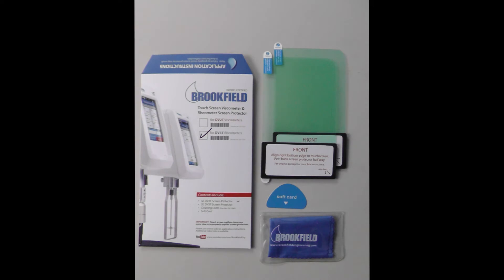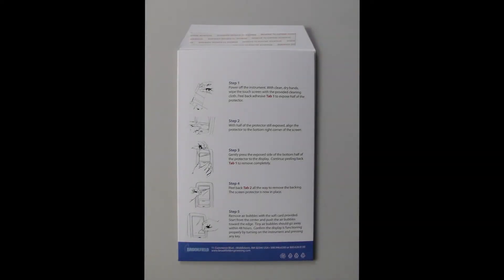Brookfield Engineering offers screen protectors for our new DV3T rheometer. Before you apply the screen protector, make sure you have read all of the instructions carefully.